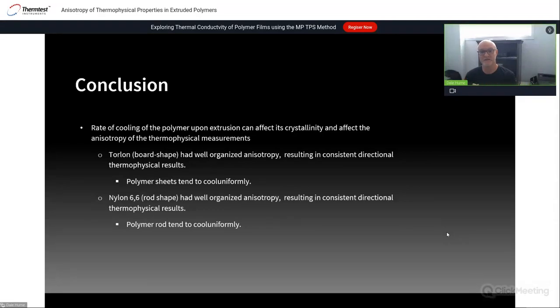So again, transient methods are measuring either a bulk property, where you are not defining any direction, it's just the natural heat. That value is suggestive of the true values, but certainly if that value is important to simulation or to an application, you might want to understand its anisotropy. And then other methods might be more uniquely qualified for higher degrees of anisotropy or heterogeneity, meaning that the sample's anisotropy is not well defined.